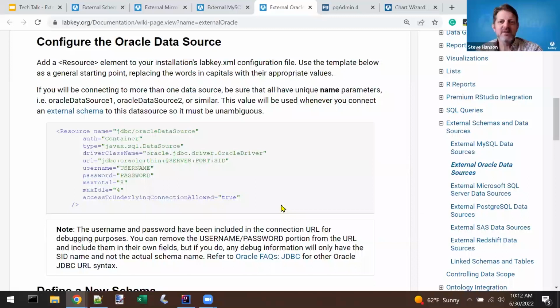Matt, do you know about this at all? Yes. I don't know which version of LabKey it is supported in, but we do have a JDBC and ODBC driver to talk to LabKey as if it itself were a SQL database.